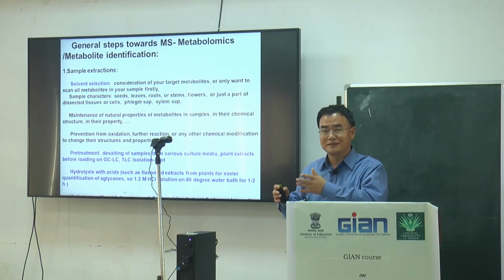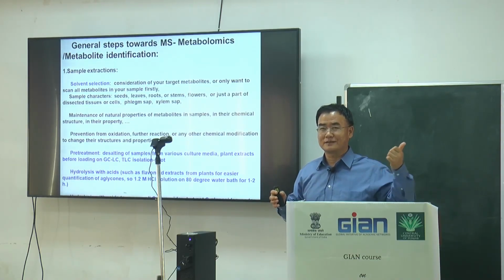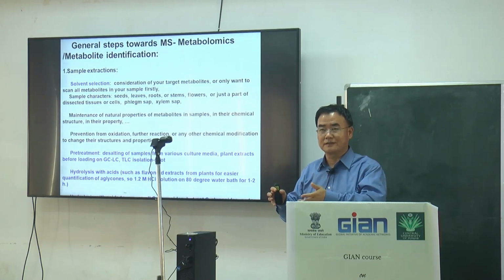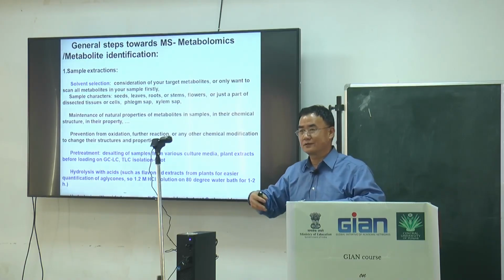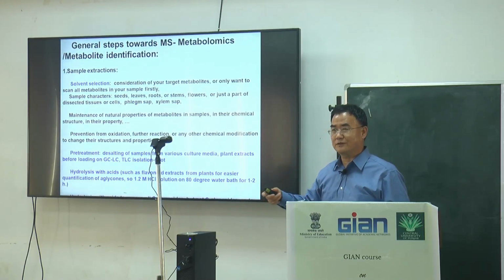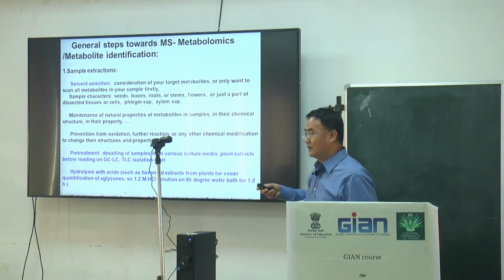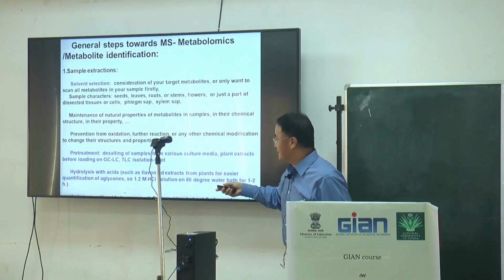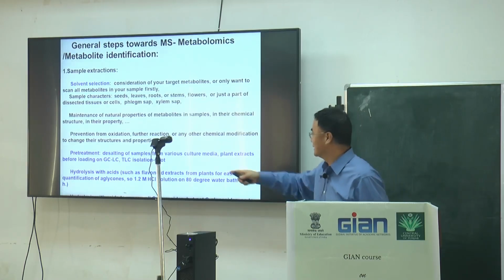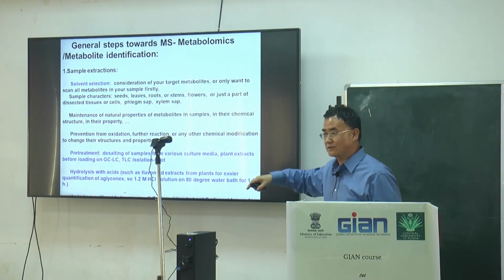Slowly some people realize this now, and some companies try to understand those compounds. If you visit those compounds, probably you will find some very interesting findings. So for analysis of spinach flavonoids, if you want to find new stuff, just hydrolyze the flavonoid extract with acid.